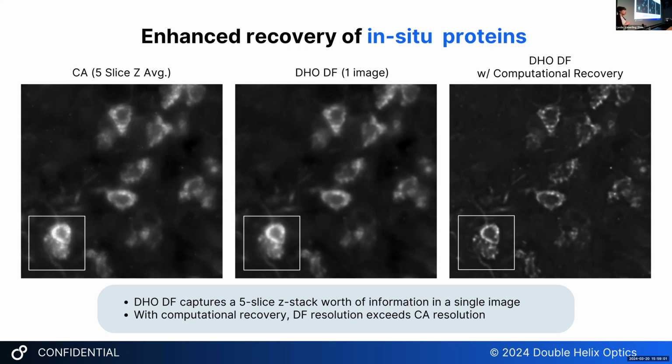Because a lot of pharma work is very high content. They're just speeding through different assay formulations, and they want to see how many of something there is. They don't really care about the details. So speed matters more than resolution, but you need enough resolution so you can identify what it is. Does that make sense?